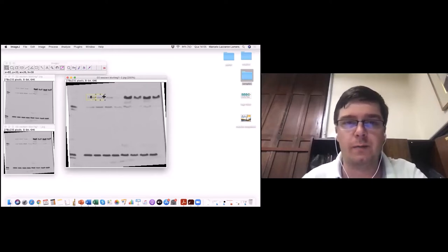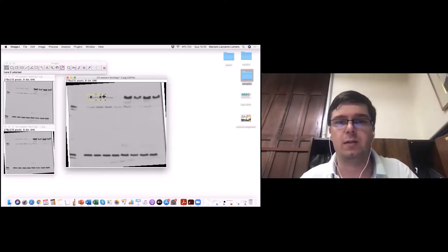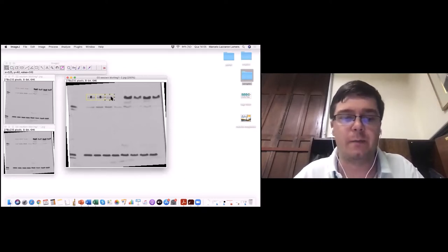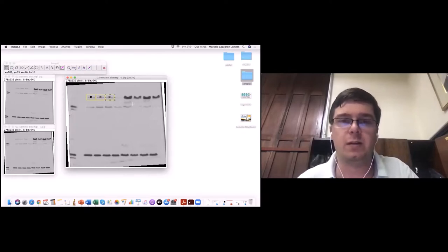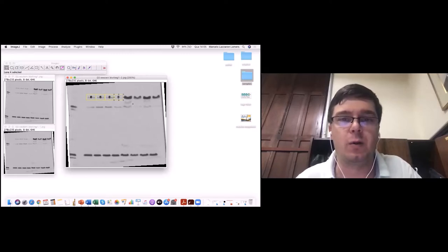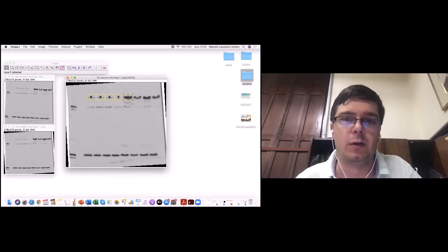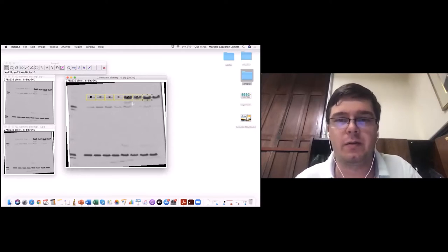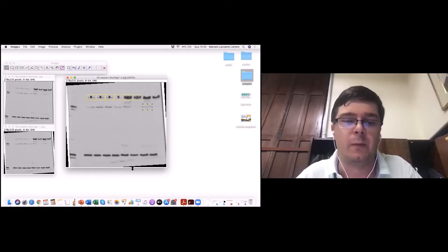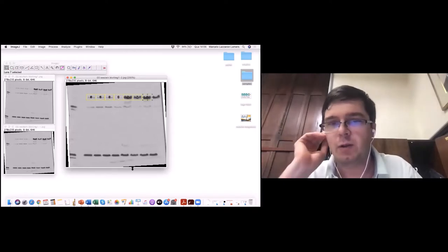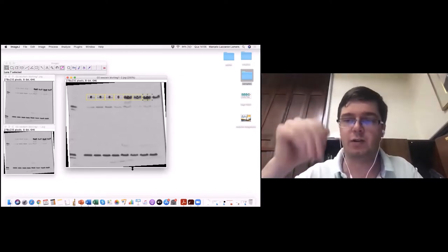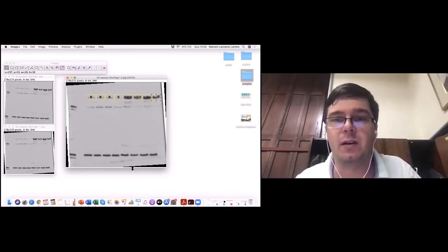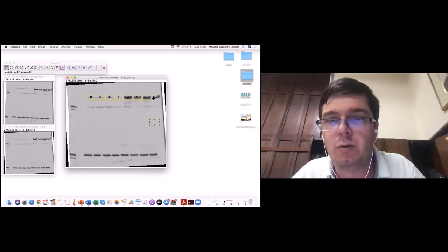Vou usar o direcional para o lado e apertar o número 2 para a segunda banda. Para a terceira banda, aperto 2 de novo — não apertar o 3, pois o 3 finaliza o processo. Continuando: 2, 2, 2, 2 para as demais bandas. Na penúltima, quando eu clicar o 2, ele volta automaticamente para a posição de cima — por isso não consigo ajustar a altura, é um comportamento do próprio ImageJ. A sétima não ficou bem colocada, pegou um pedaço da outra banda.